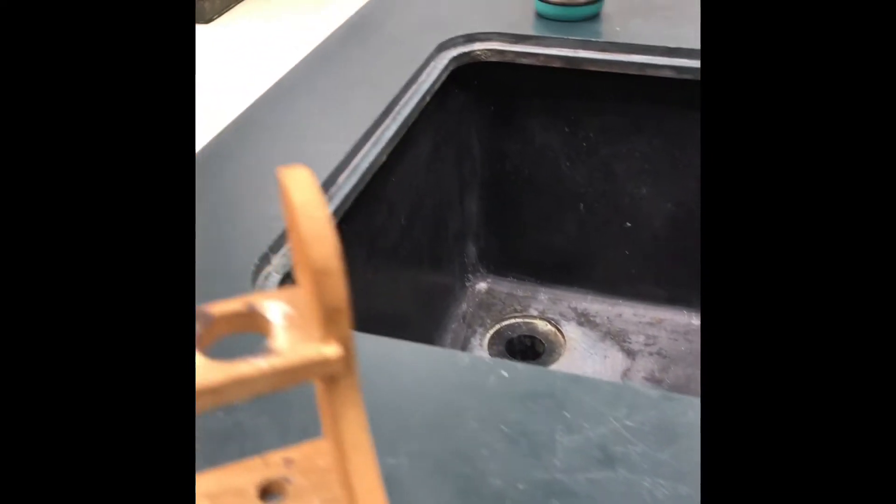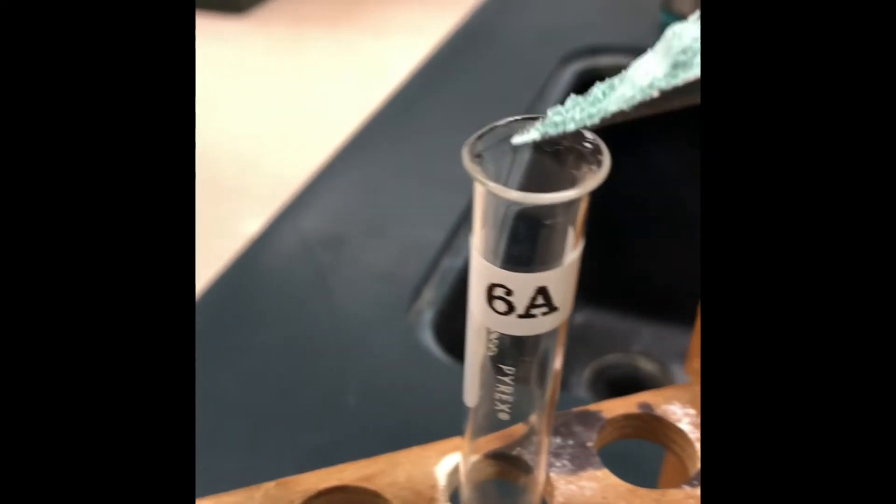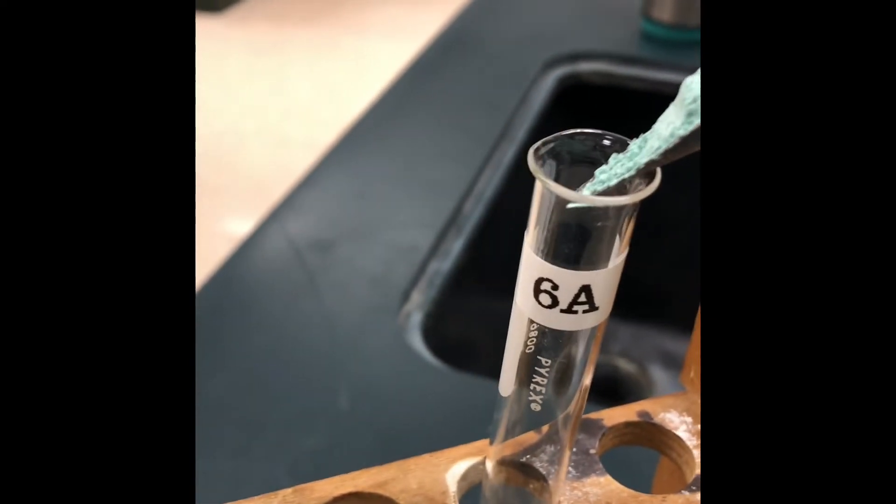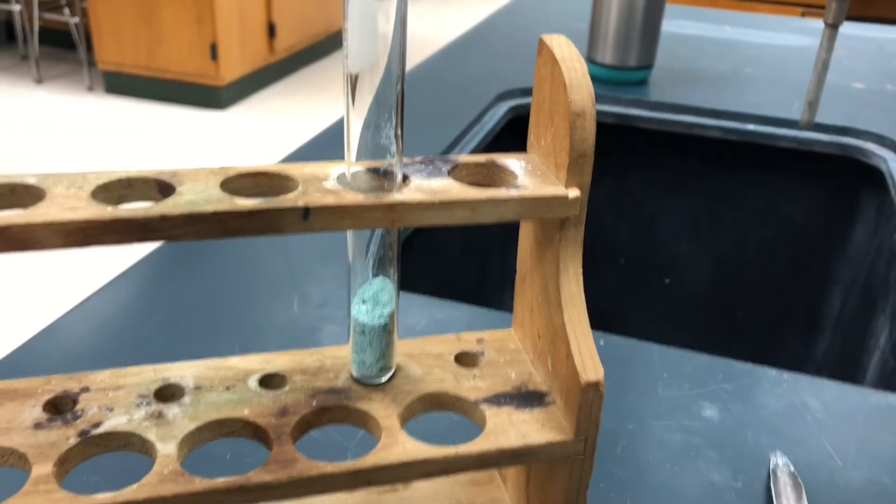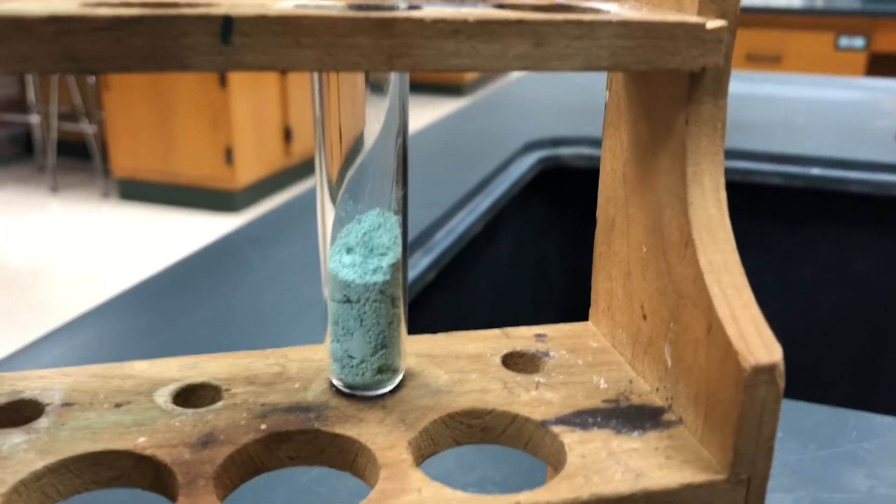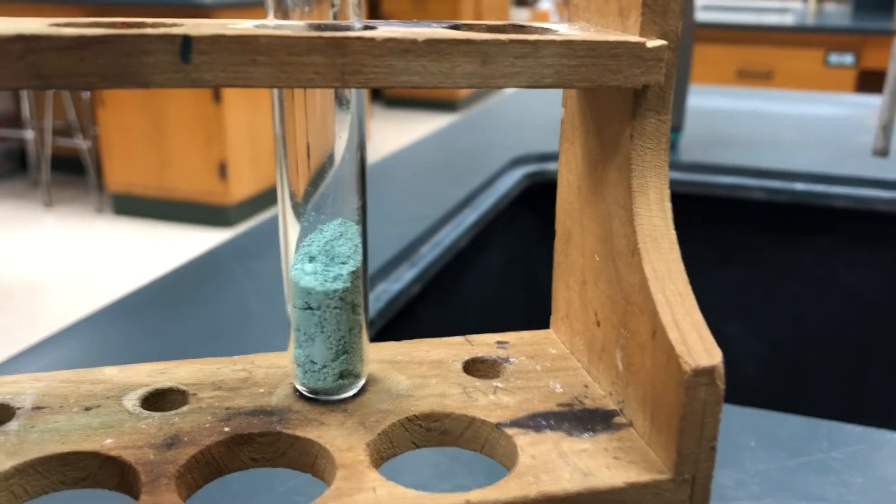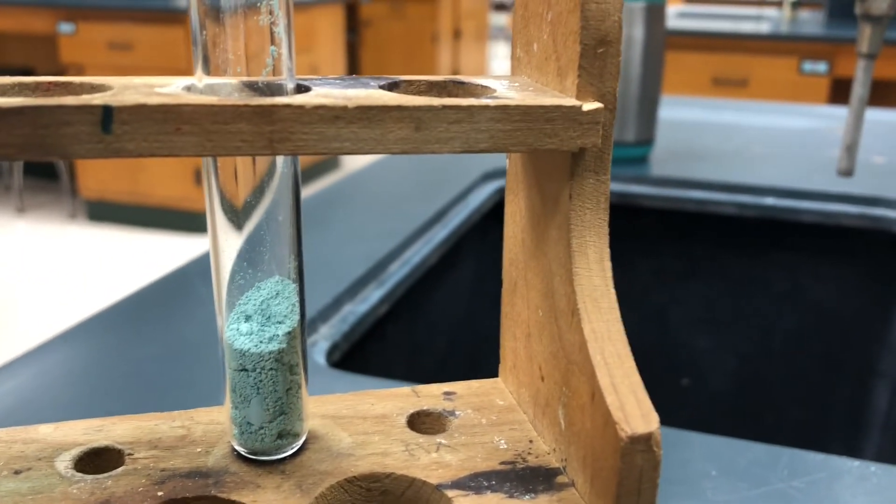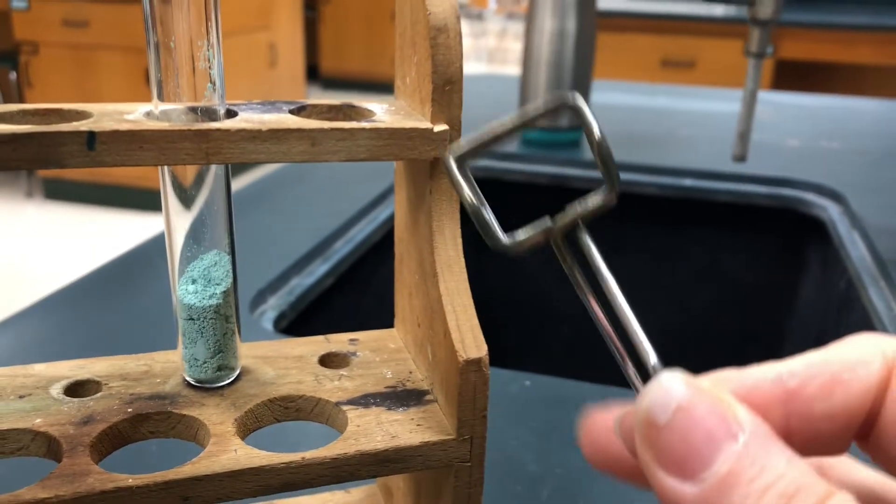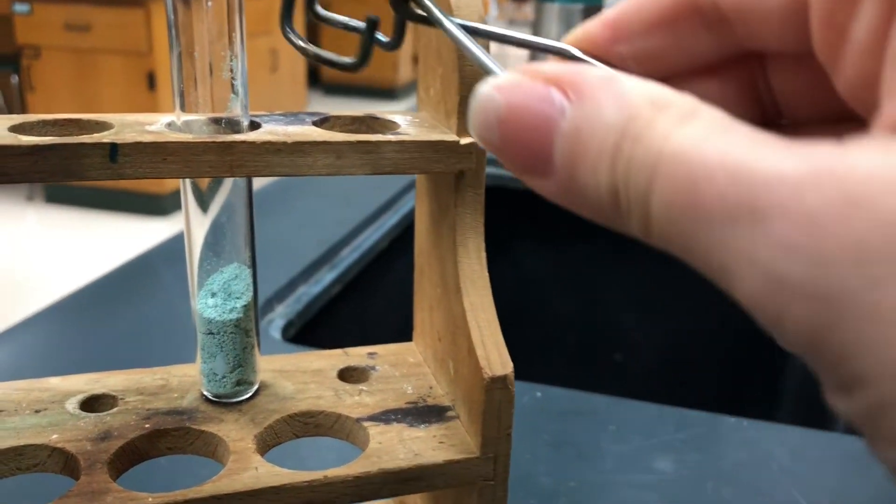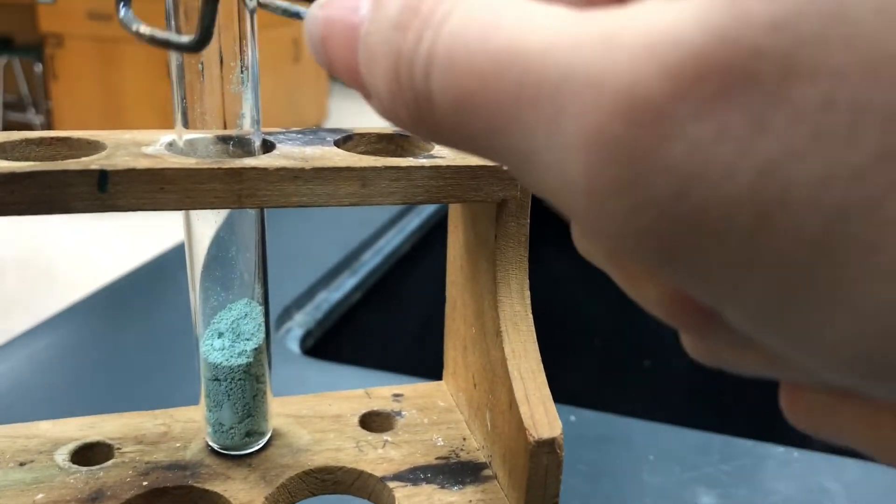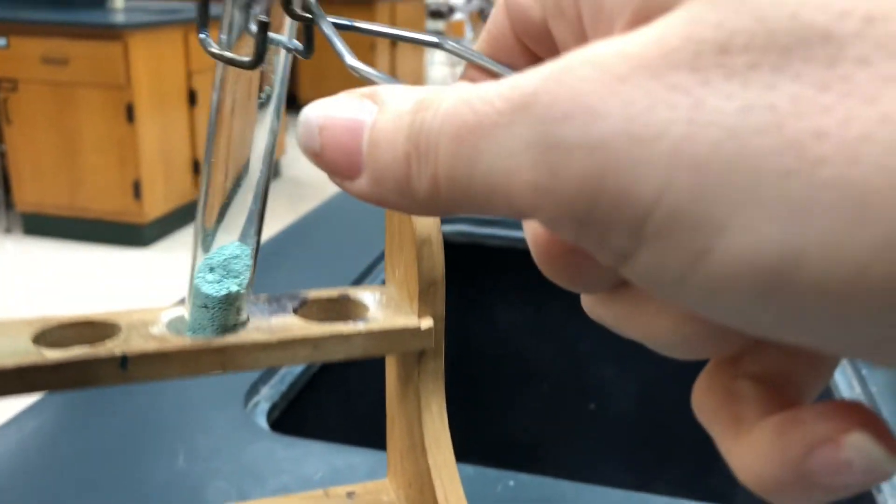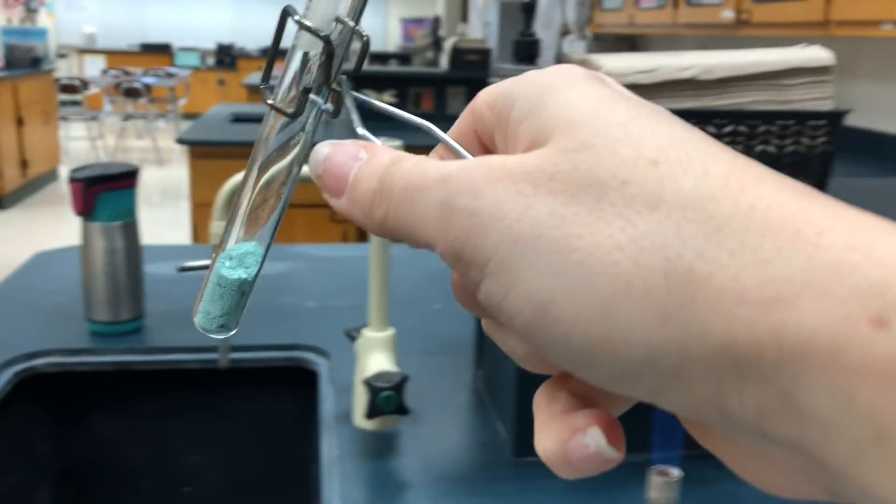I'm going to take a scoopula of this compound and put it inside my test tube. You can see that I have a couple scoops of that compound sitting there in the bottom of the test tube. Now I'm going to grab a piece of equipment called a test tube holder. I'm going to clamp that test tube into the holder and bring it over to my fire.